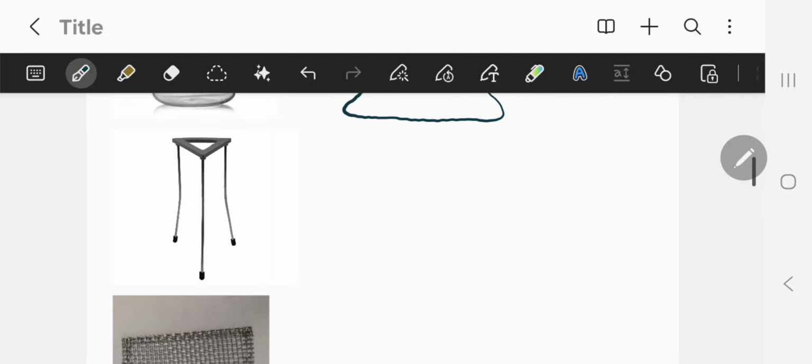Then you have a tripod. Now, think of the word tri. A triangle's got 3 sides. There are 3 sides to this, okay? It's a triangle. It's got 3 legs as well. I usually draw 2 legs. So a tripod, looking side on.